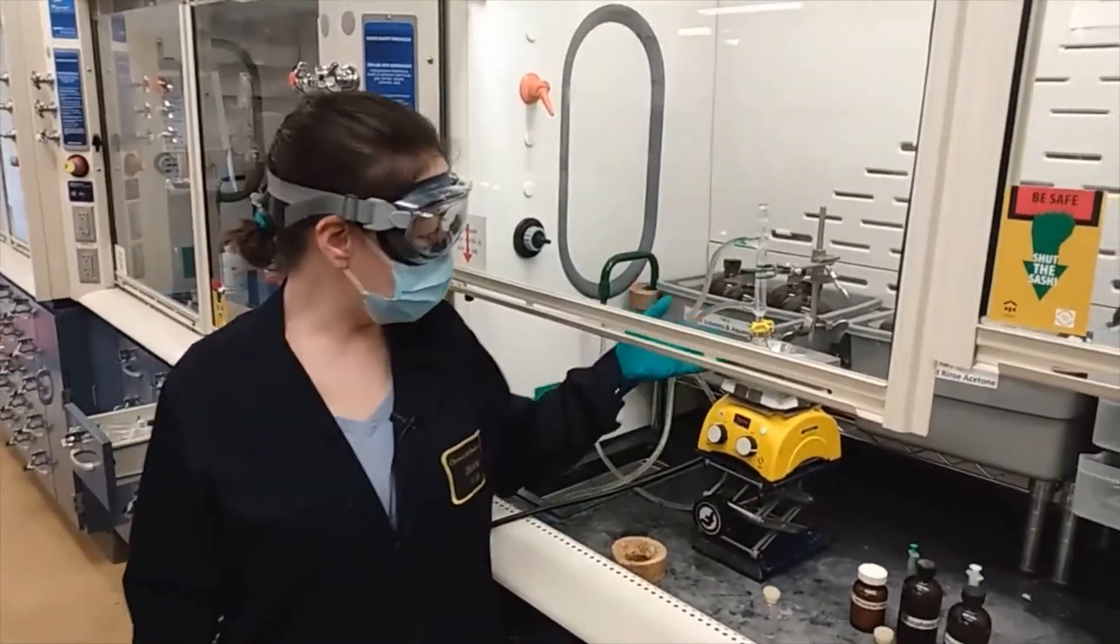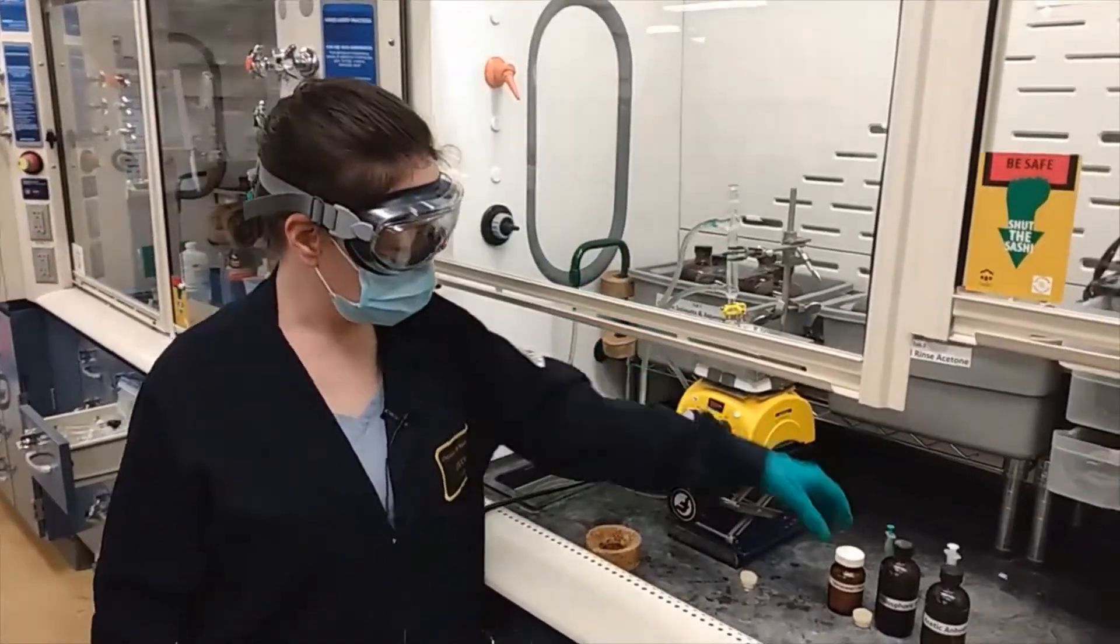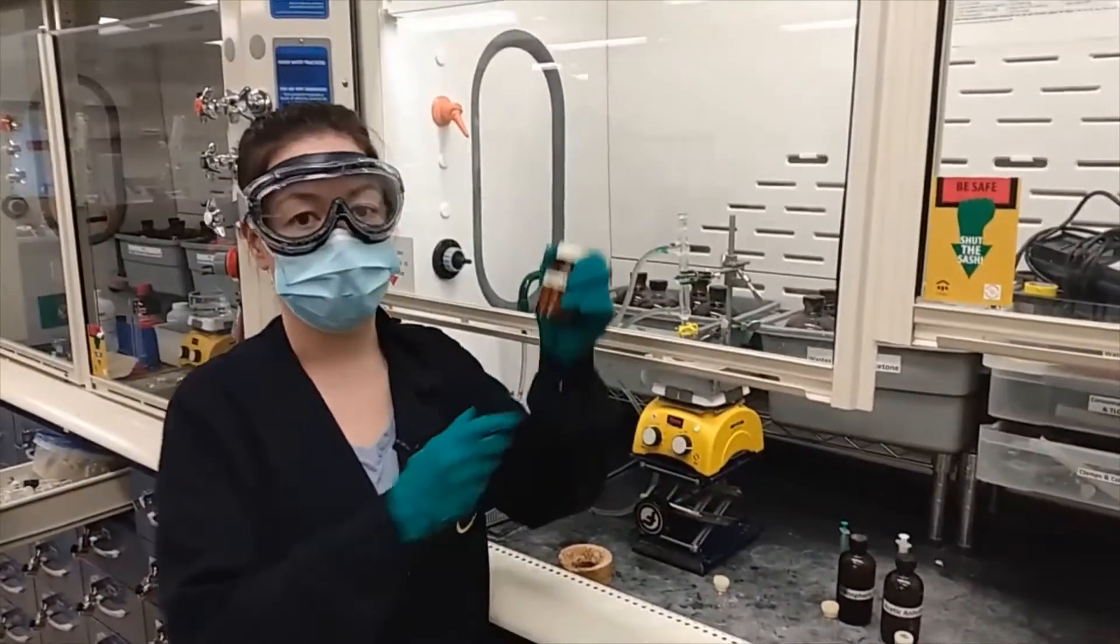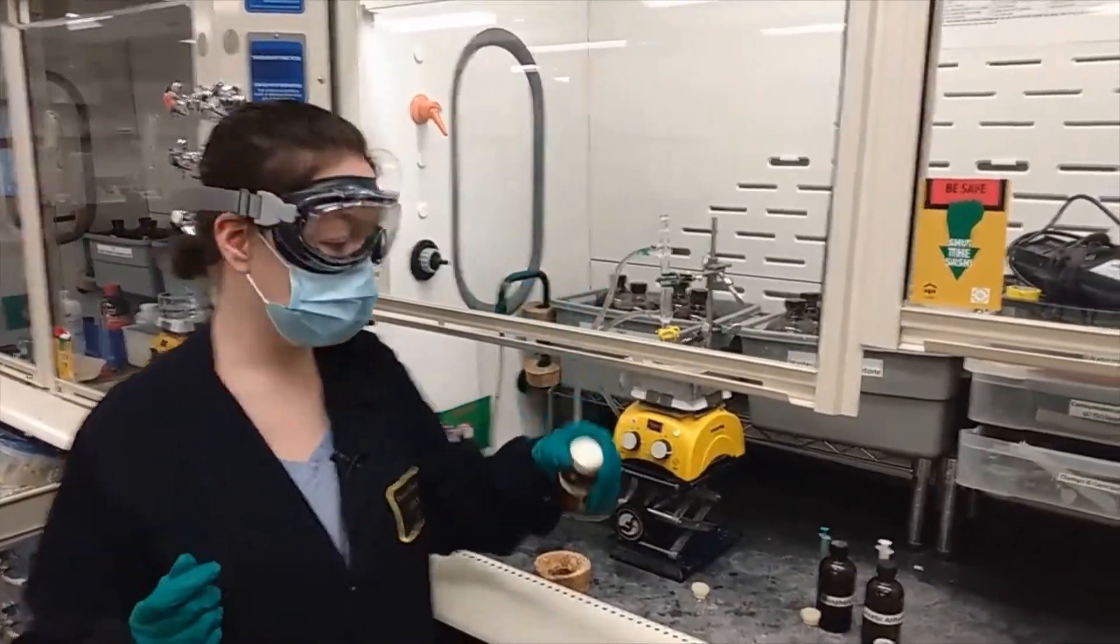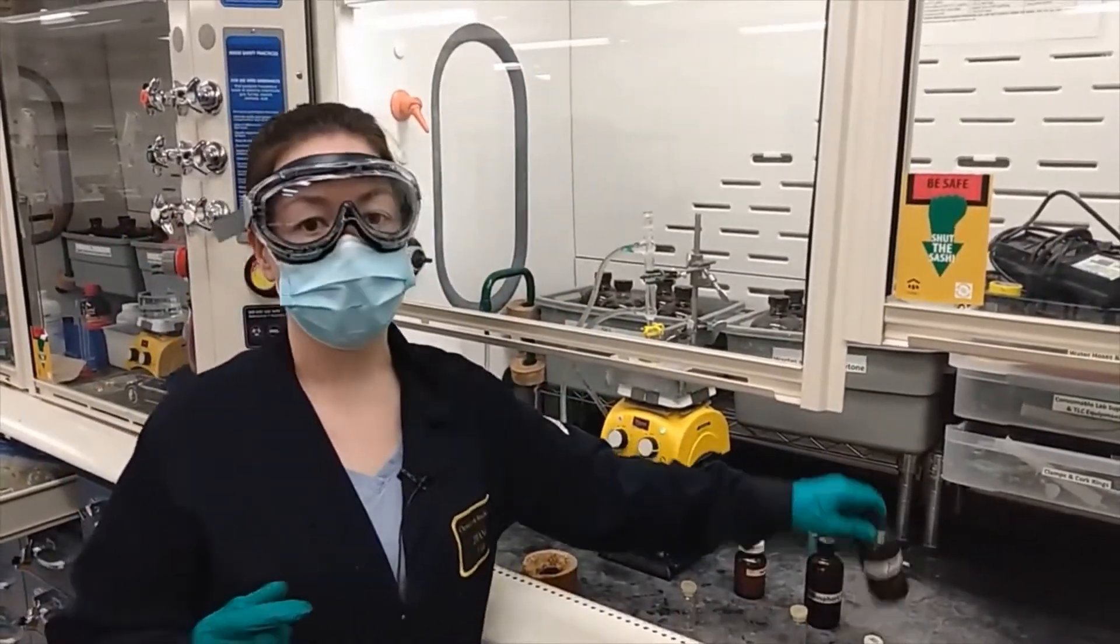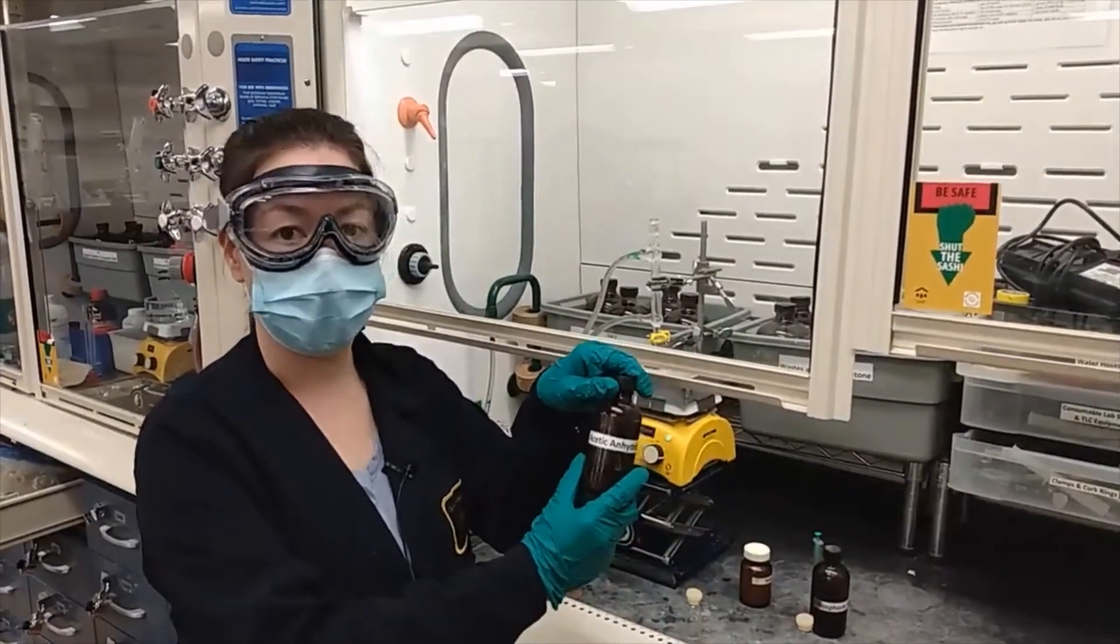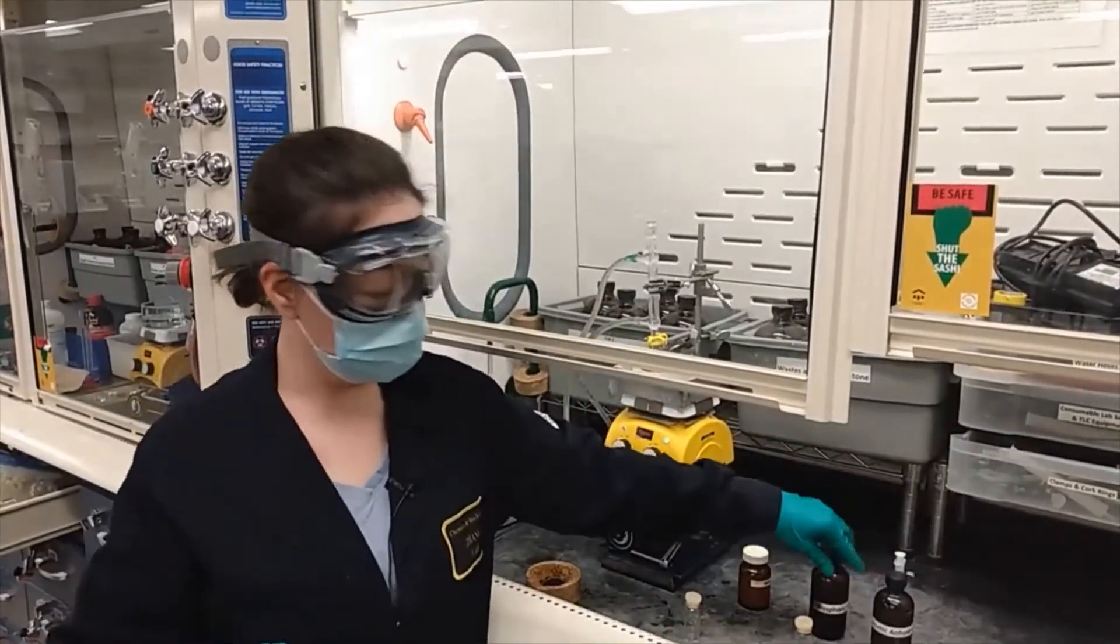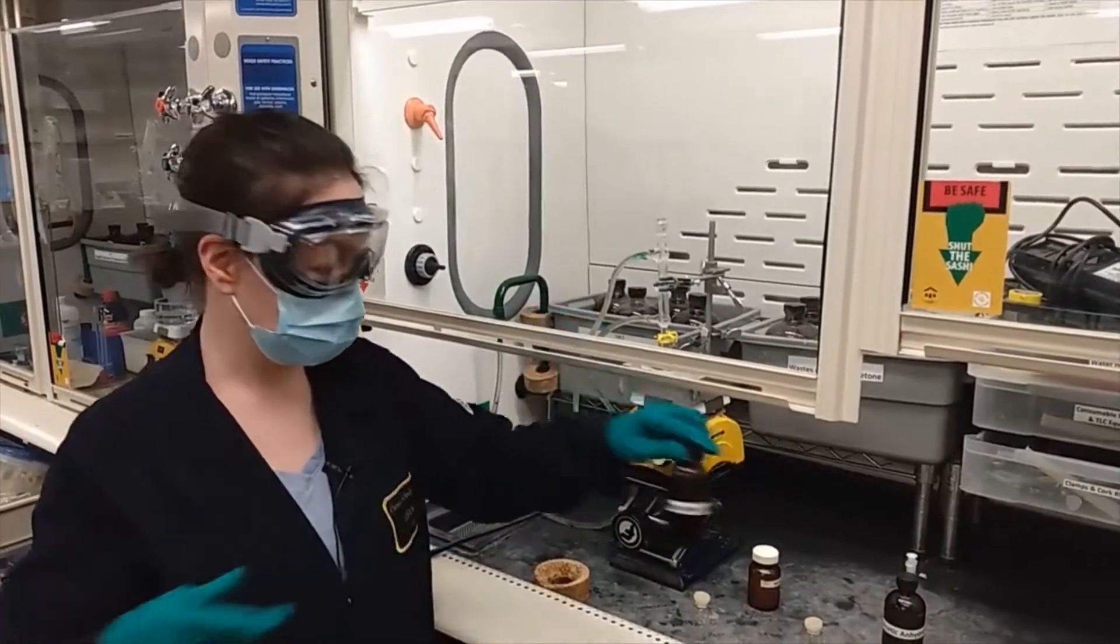So this is the reaction. We set it up with one millimole of ferrocene or 186 milligrams. To that, we added two milliliters of acetic anhydride and 0.4 milliliters of phosphoric acid.